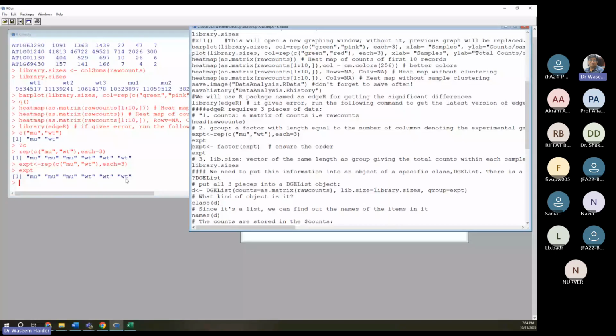There are two possibilities, or if you include transgenders, there are three possibilities. So these three things are called factors, or levels, sorry, levels of that factor. So only one factor is here, but there are three levels, male and female and transgenders, right? Or just male and female. In that case, this is a binomial variable that has two things.